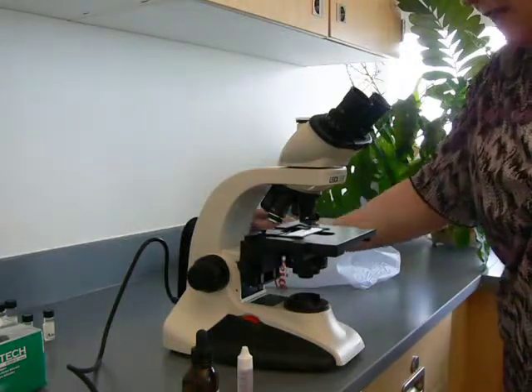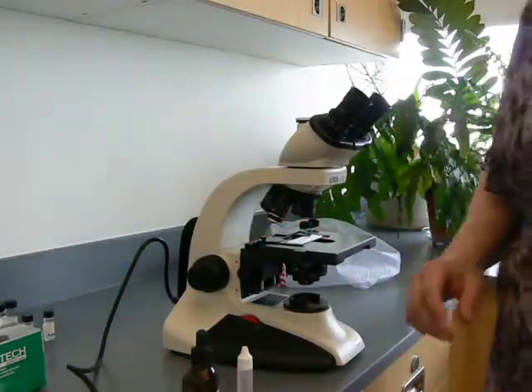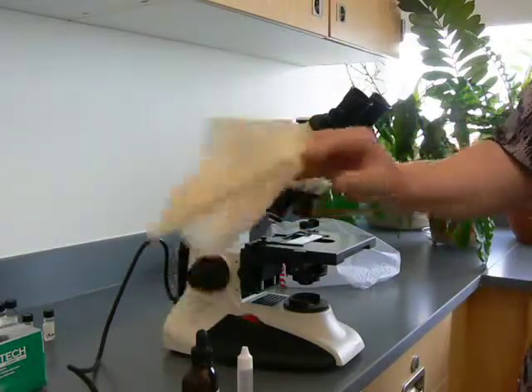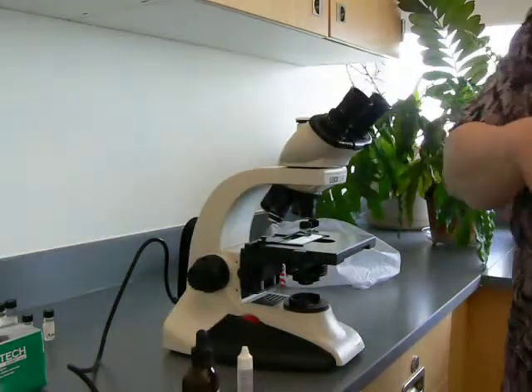I'm going to lower the stage, give myself some more room. Now, let's start with the don'ts. Death will happen if you use anything like Kleenex or paper towel on the microscope. So let's get that away from there.